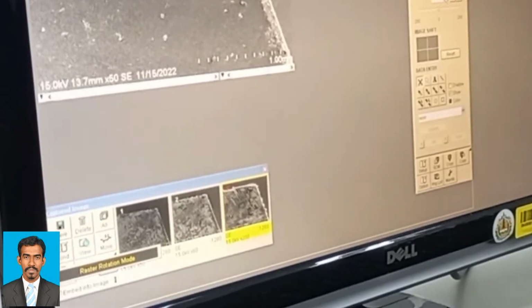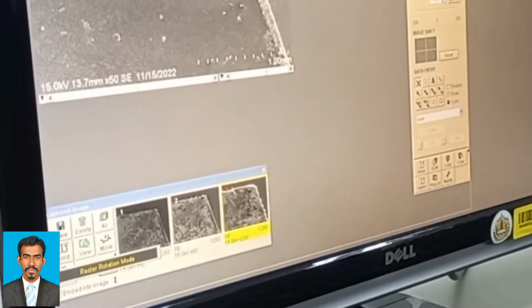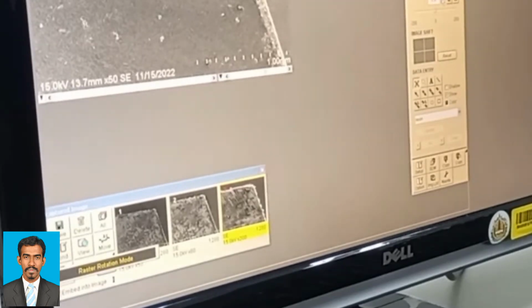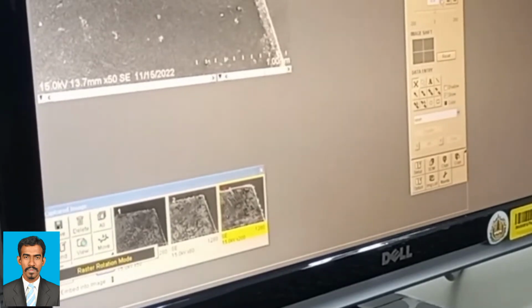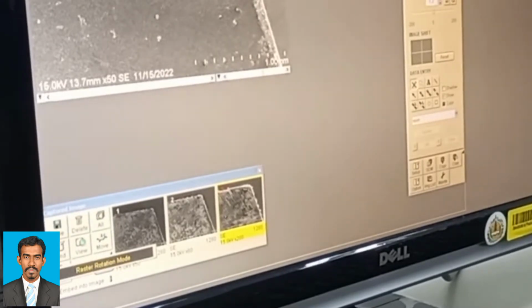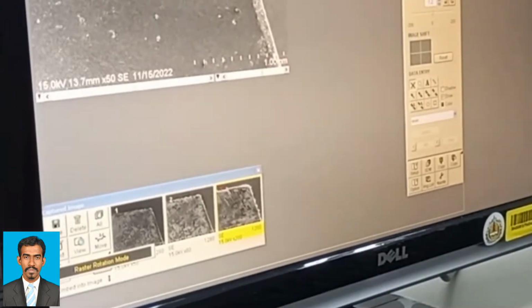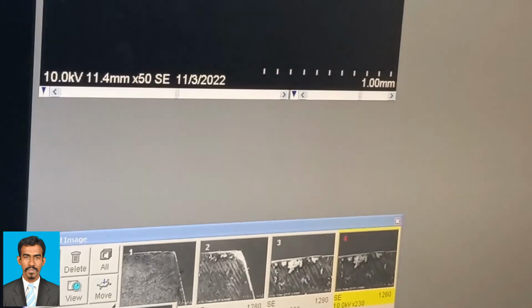The Cond button opens the Ope.Cond tab of the setup dialog box. The Photo button starts memory photographing of the selected image. The Move button moves the stage to the position where the selected image was captured. And the PCI button transfers the selected image to the Quartz PCI database program.